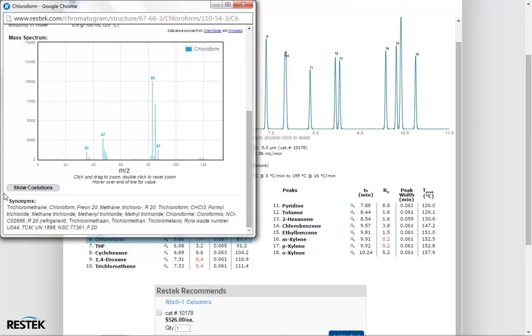When we click that button, any compounds near hexane not meeting our resolution criteria will be overlaid on top of our original spectrum. This makes spectral comparisons a snap and is a great tool for MS method development. The spectral comparisons will compare up to 3 spectra, so if you have 3 co-eluting compounds, you can click on the middle one and it will overlay the other 2 on top of it.